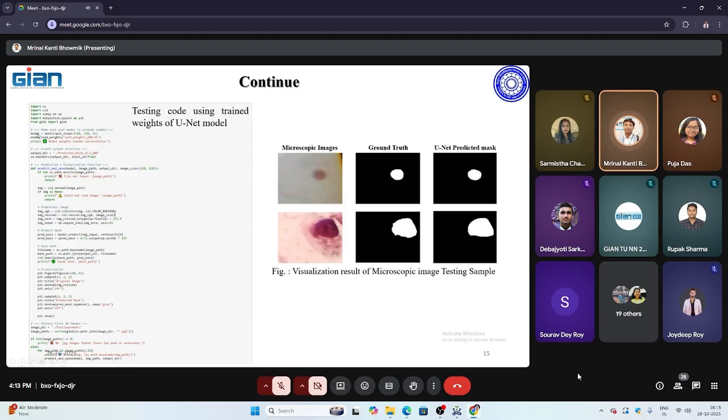First of all, we call the same U-Net model definition where the model has learned the information, because if I do not call the model which I have trained, then I can't do load weights, meaning to load the weights which have been saved as unet weights 100.